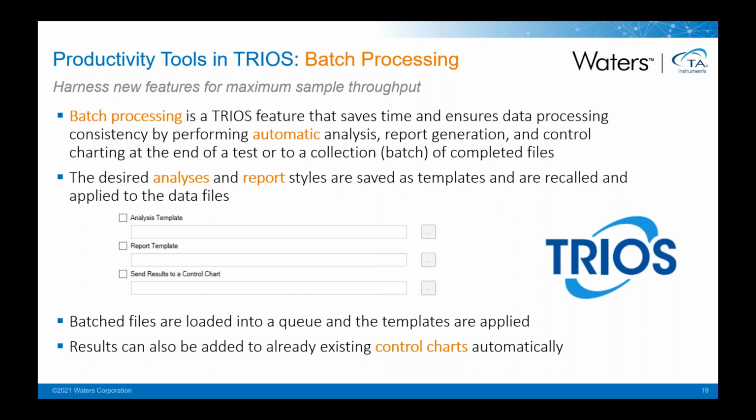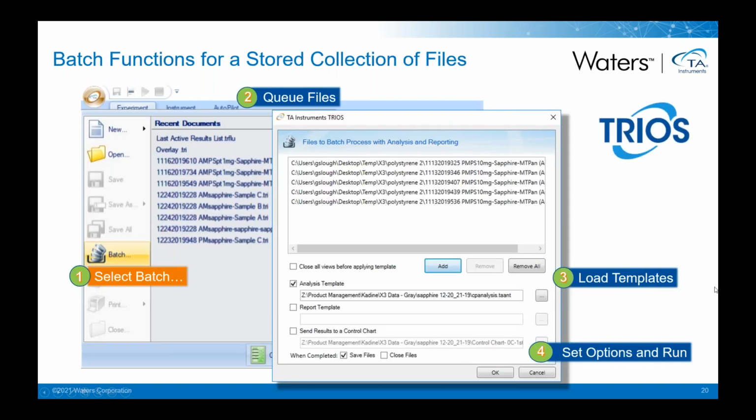The batch processing component, at least this side of it, allows you to automate that process. But there are also times where maybe we didn't know how to analyze the data when we first collected it, and so we just have a whole collection of data files that we need to work through. Again, that could be very time consuming, but we also have the batch process associated with a stored collection of files.